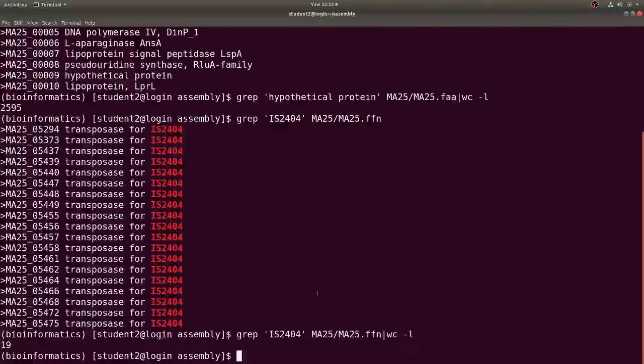Right. So the annotation you perform helps you to understand your genome and its genomic makeup. Okay, it can even help you to differentiate between maybe a wild type strain and another strain that was found in a different community, probably where there is a disease or not. And it also helps you to understand the evolutionary story of your genomes. So these are a couple of interesting things you can find out through genome annotation. We are going to go into details with this in a later tutorial, but for today, it was a demonstration to show you how to perform the annotation with the Prokka tool.